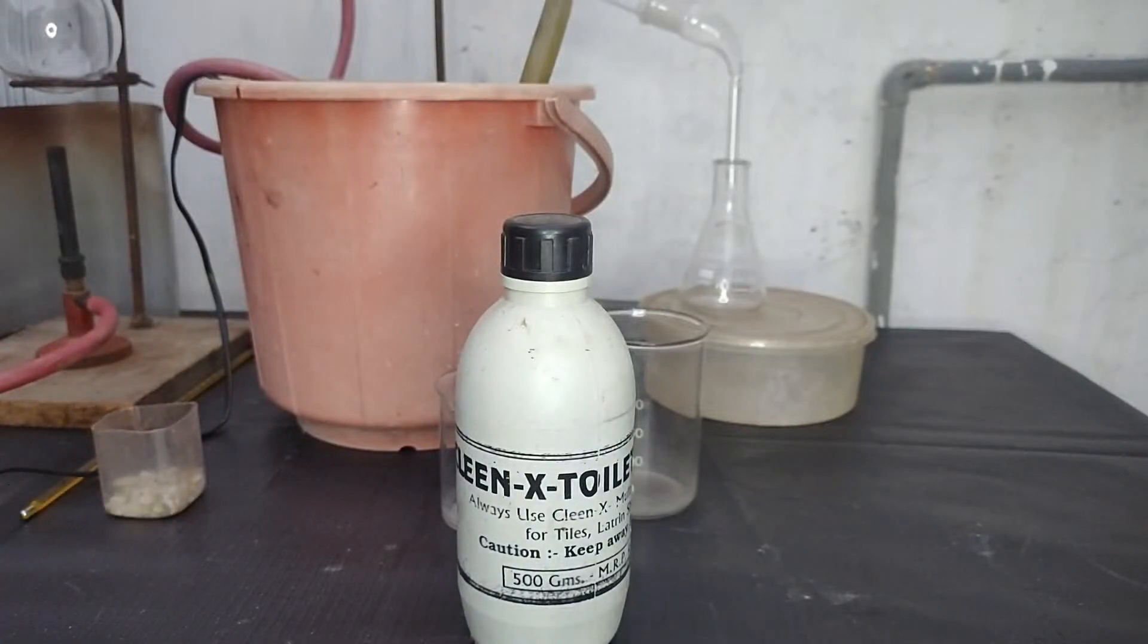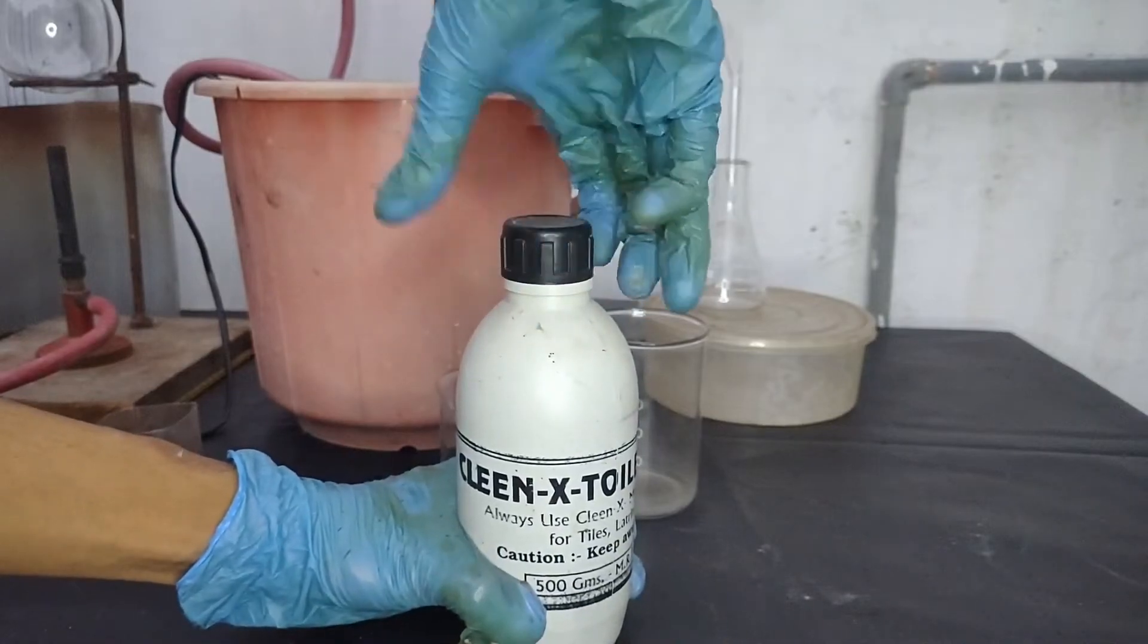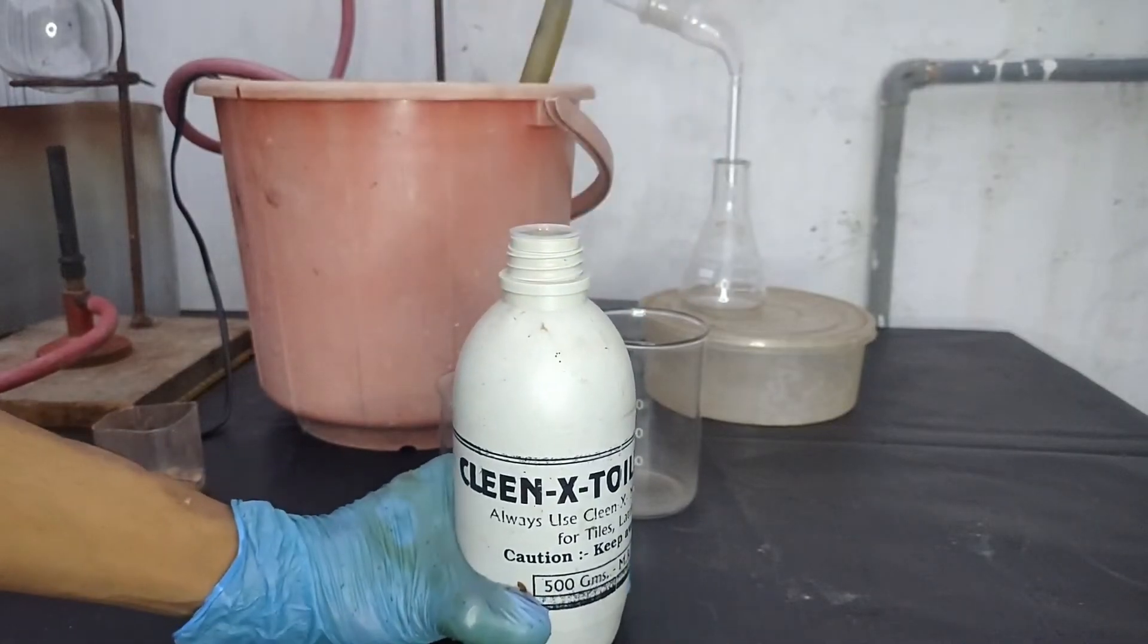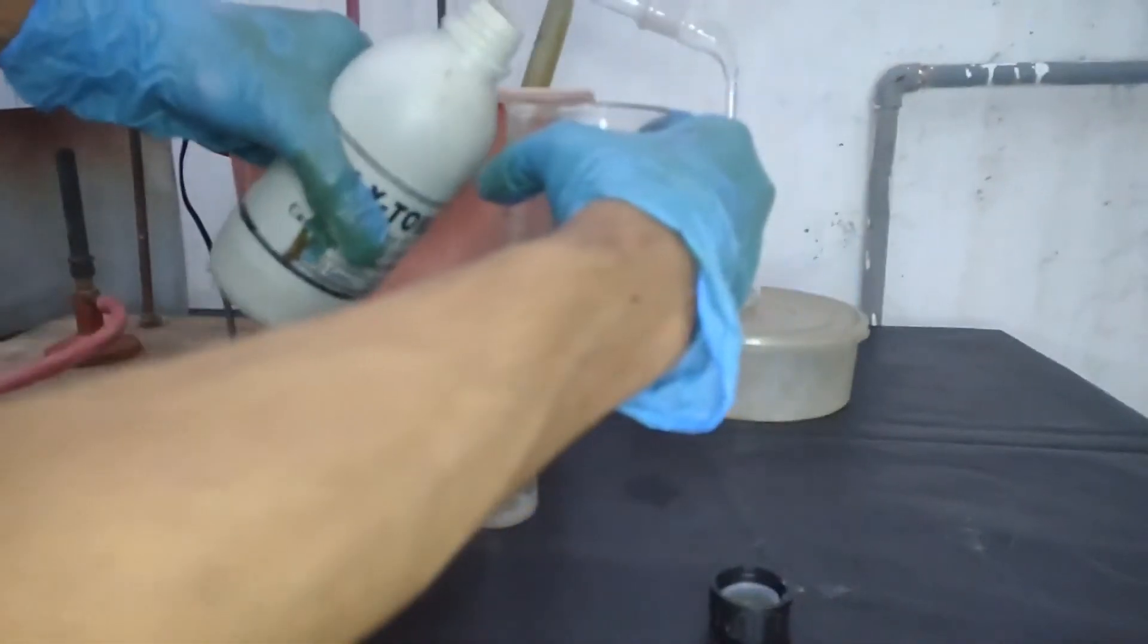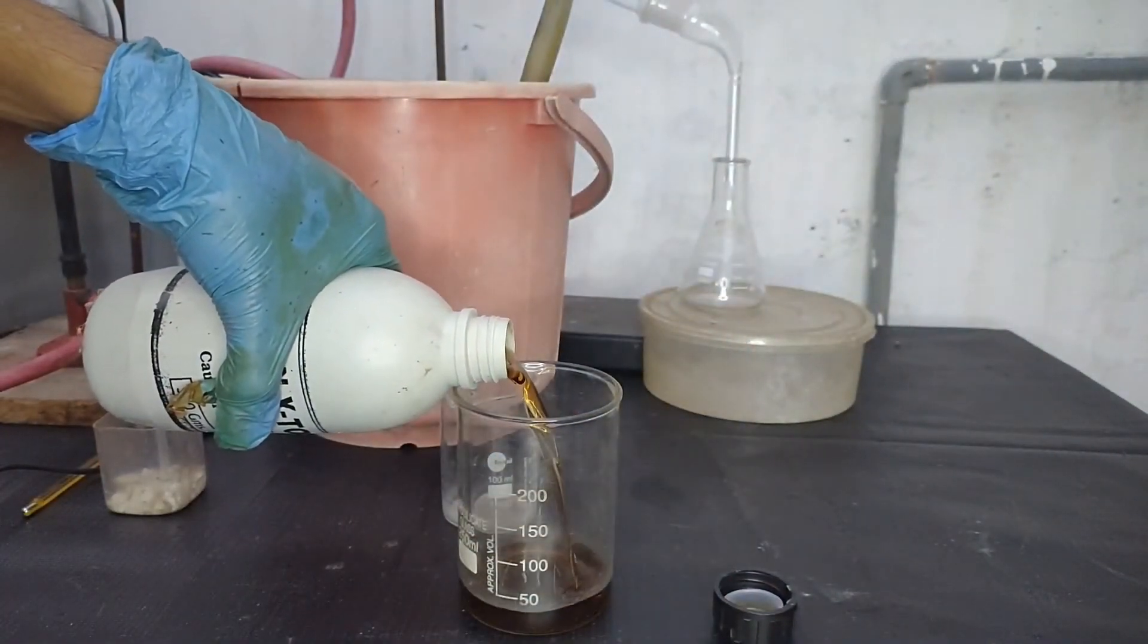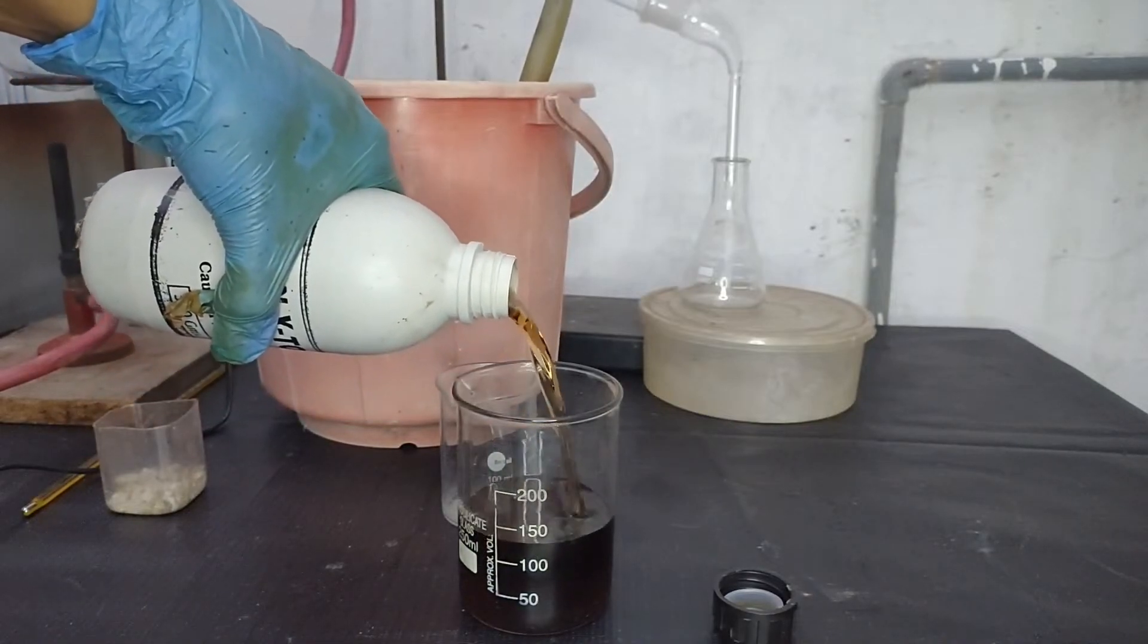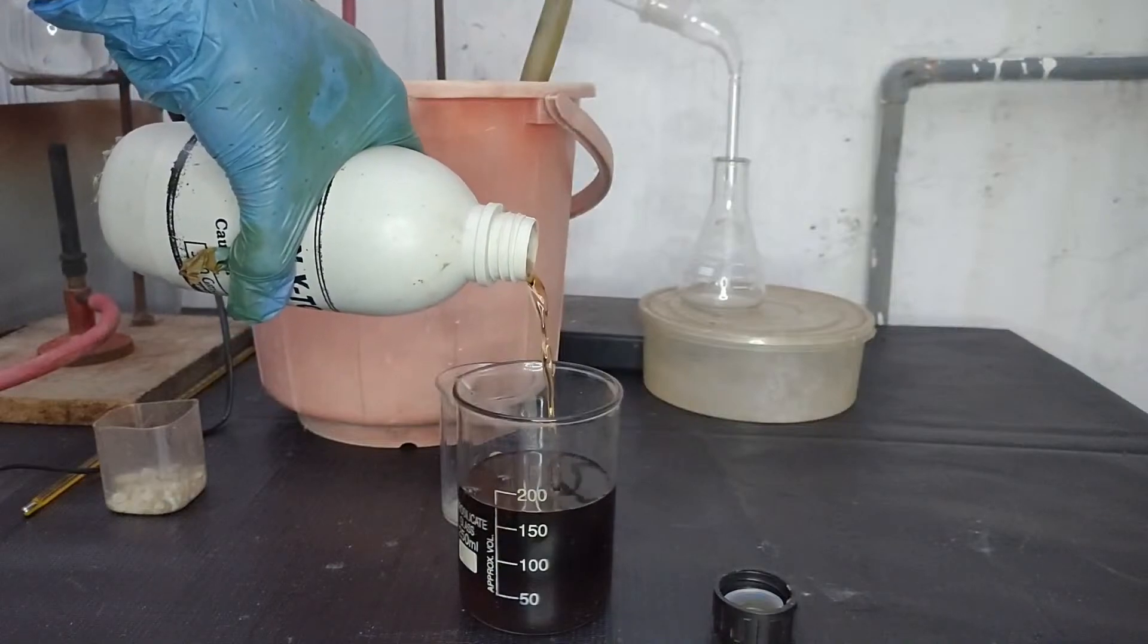In this video I will try to concentrate my drain cleaner sulfuric acid which has a concentration of around 90 to 92 percent. Over here I am taking 200 ml of drain cleaner sulfuric acid. As you can see it has a brown color.